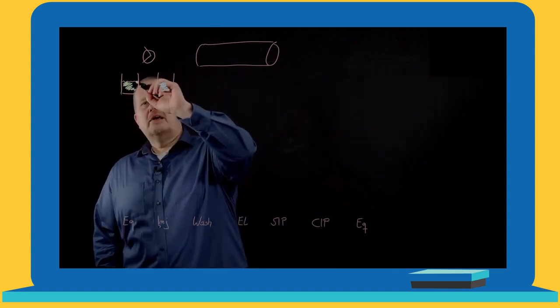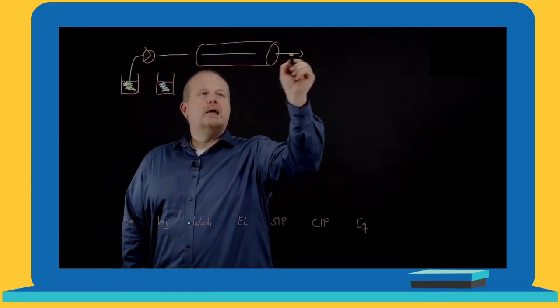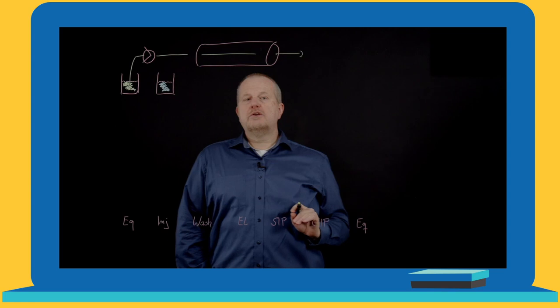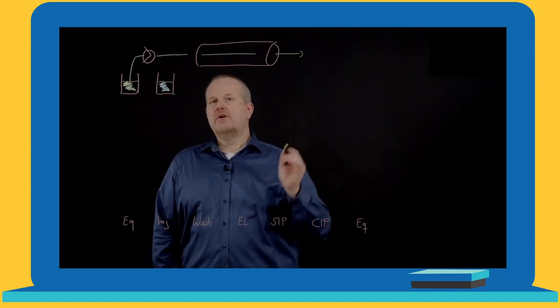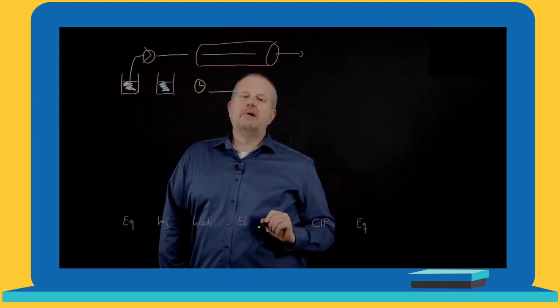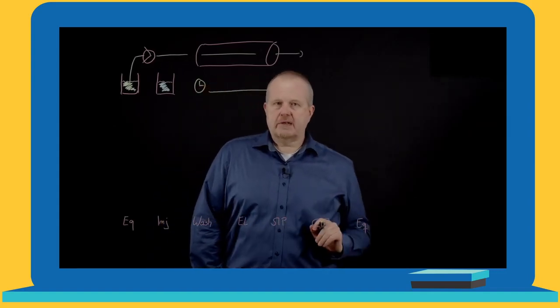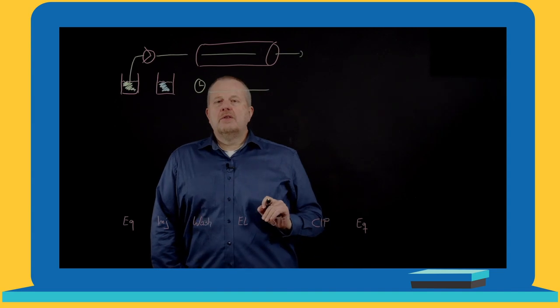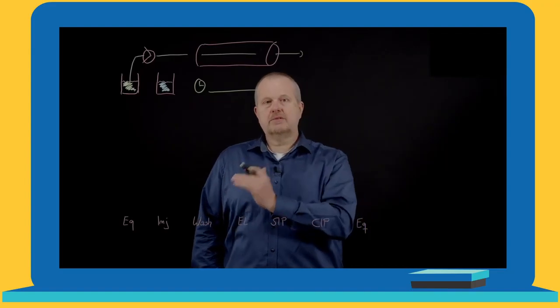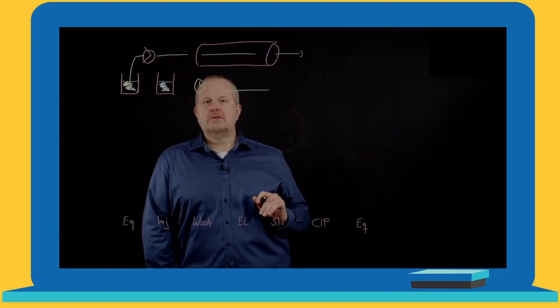We had a mobile phase, and this mobile phase was pumped through a pump, through the column, and here we collected our compound. But we never changed the composition of our mobile phase. So over time, the composition of our mobile phase was always the same. This is a situation which we call isocratic. But it's not the widely used method. It's a very easy method because you only have one solvent. But in most of the cases, you need more than just this one solvent.